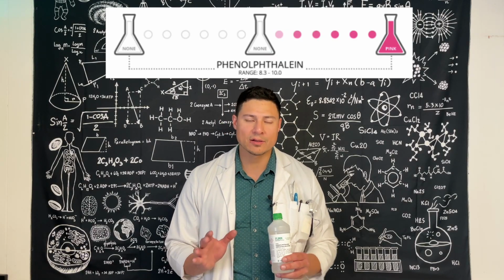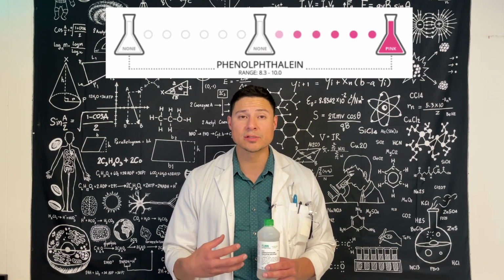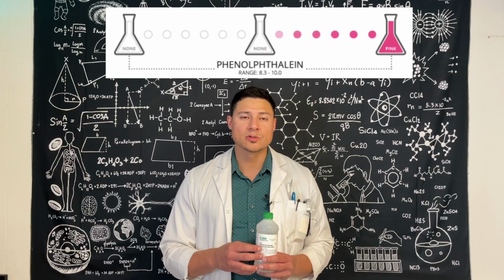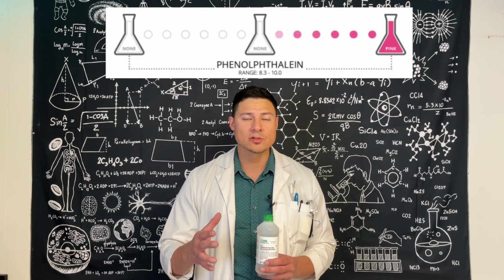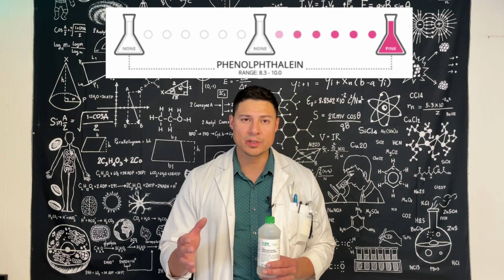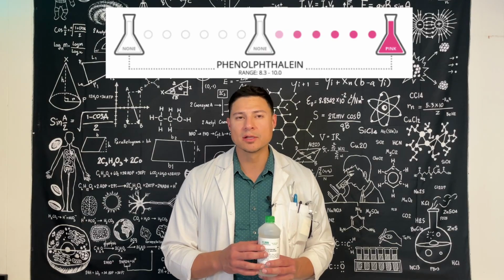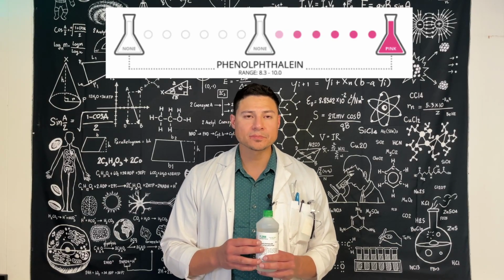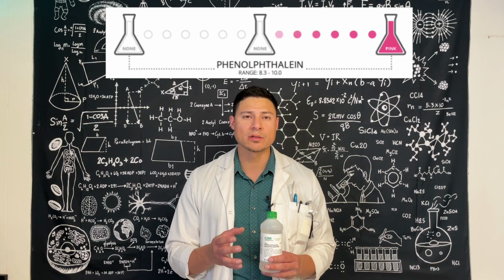It's not going to react with the substance that we're looking at, but it will change colors if it detects the presence of a base. So it's going to change to the color pink. So if there's a base in the solution, it will change to color pink. If it's an acid or neutral, nothing's going to happen. So initially, it should be in water, which is neutral, shouldn't change colors when we add the drops.